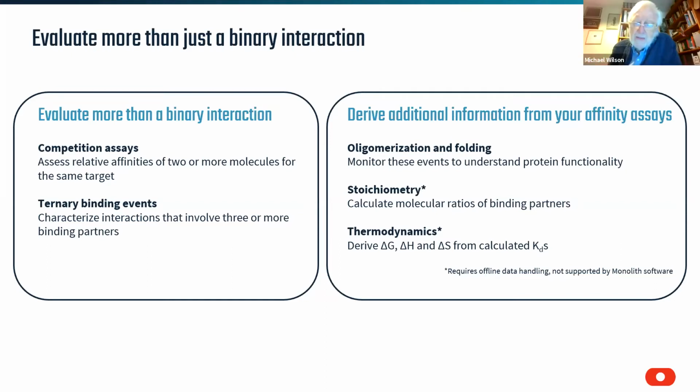I was wondering how much does the laser heat the solution? It does depend on the measurement times, but say a standard measurement, it would be no more than 10 degrees increase by the end of the measurement. But there are different time points at which we can guarantee that it will be no more than 5 degrees. I was wondering if that ever caused a problem, because your KD is also temperature dependent. So it'll be different at the beginning and at the end of the experiment. So you're measuring some sort of average, aren't you, really?